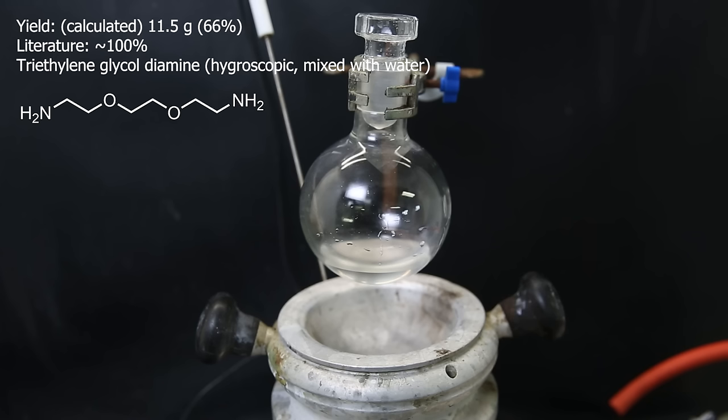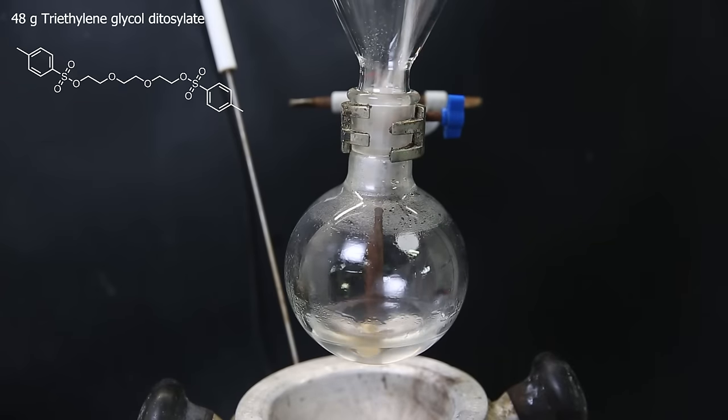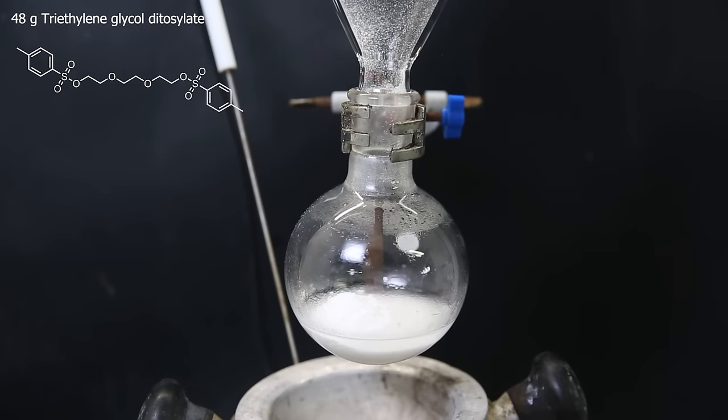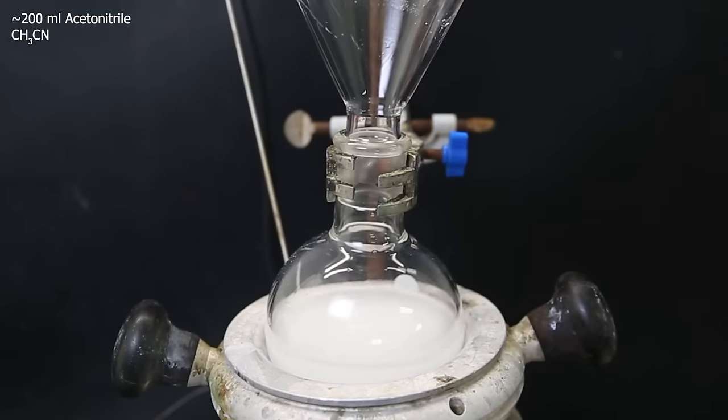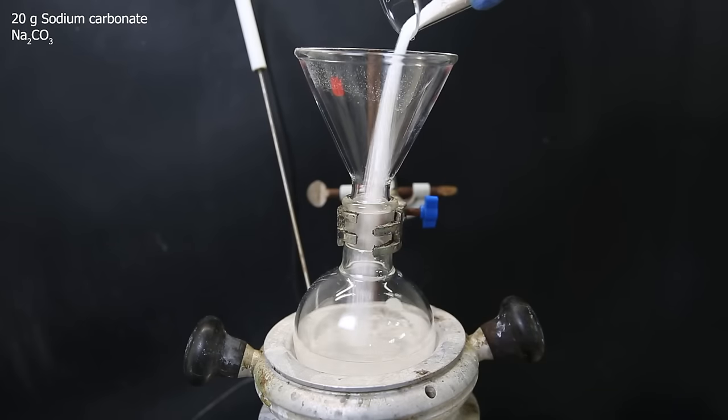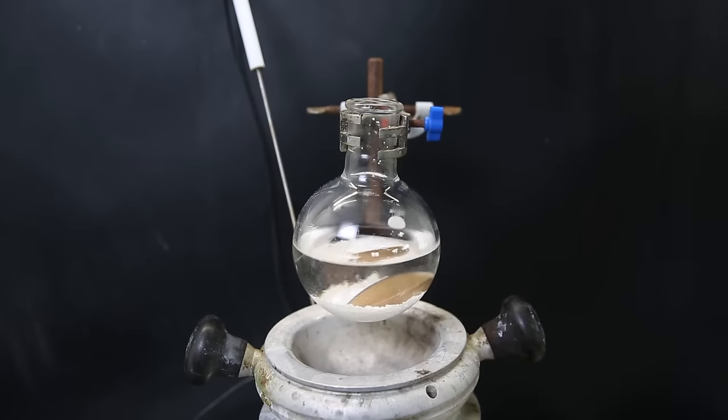Now that the synthesis of the amine is finished, I can move on to making 222-cryptand. So to the amine, I add 48 grams of the ditosylate that I saved from before, and then dissolved it in about 200 mils of acetonitrile, and add about 20 grams of sodium carbonate as a base.